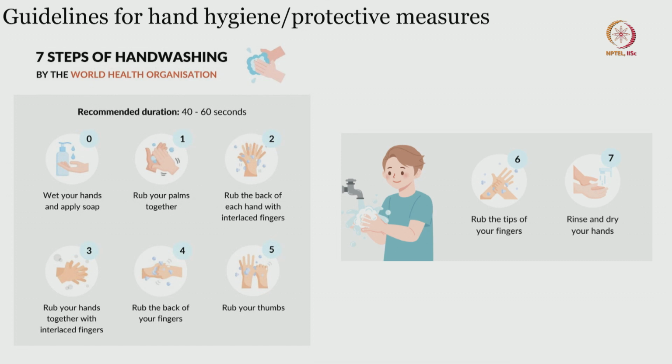the next few slides. So once you're in the lab with the lab coat, you need to remove your gowns and gloves which you used for animal handling. Before you change into the scrub suit, which is the OT dress required for surgery, you need to make sure that all the unsterile steps are finished.